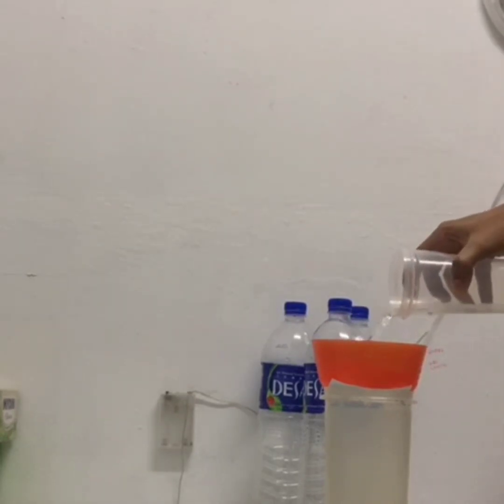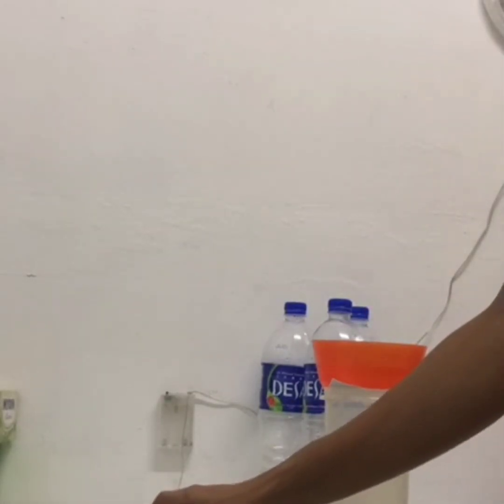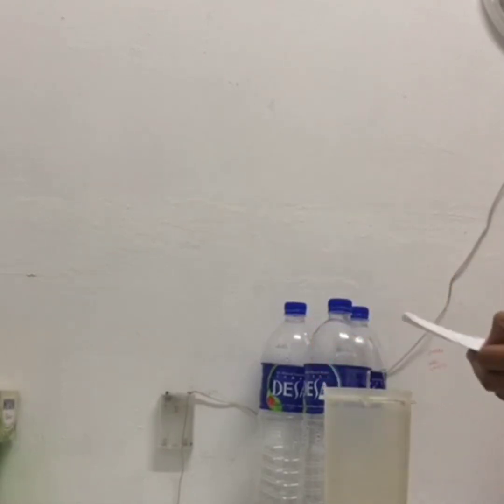Turn off the pump and transfer the filter to an aluminium dish and then place the filter in an oven and dry it at 103 to 105 degrees Celsius. Finally, weigh the filter after it cools down.